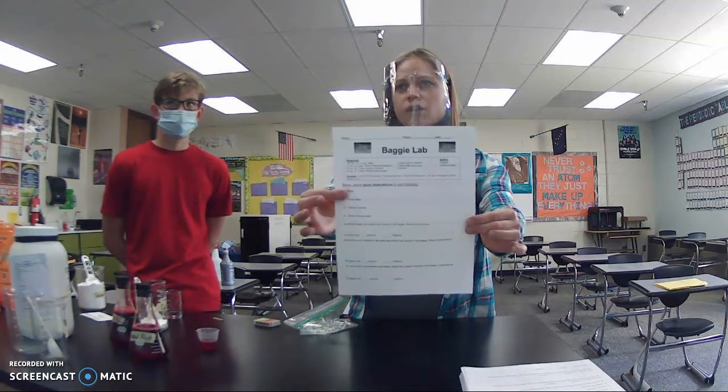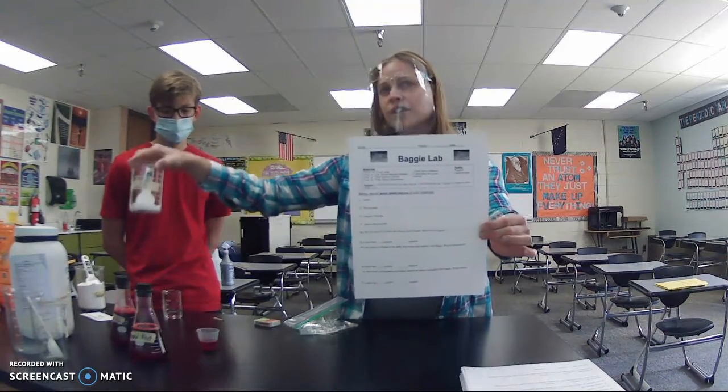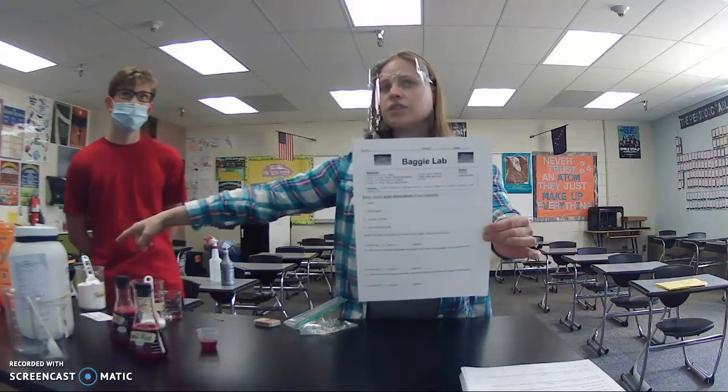We have water, I know you can't read that, but water, phenol red, calcium chloride, and sodium bicarbonate. So here's our calcium chloride we'll be using. Here's our sodium bicarbonate. We're just going to run through the lab very quickly so that you can see what we are doing in class.